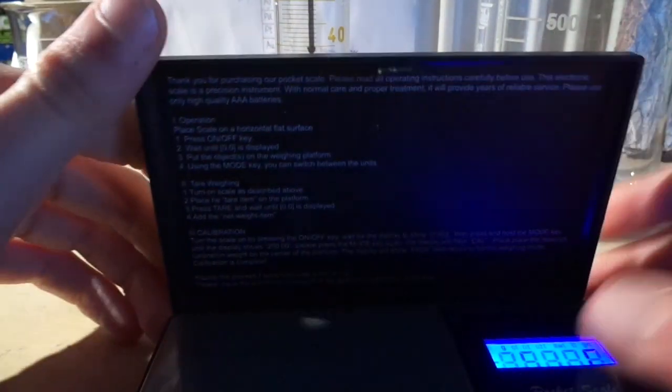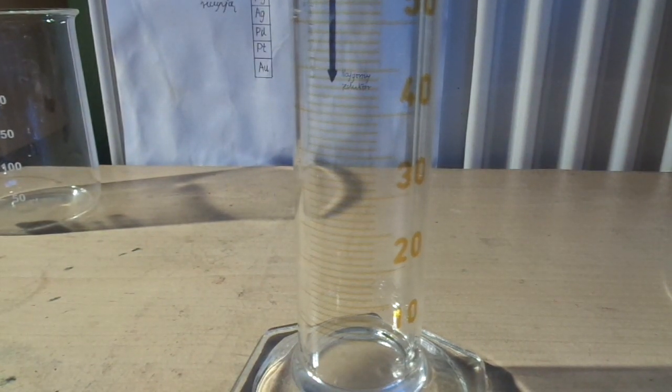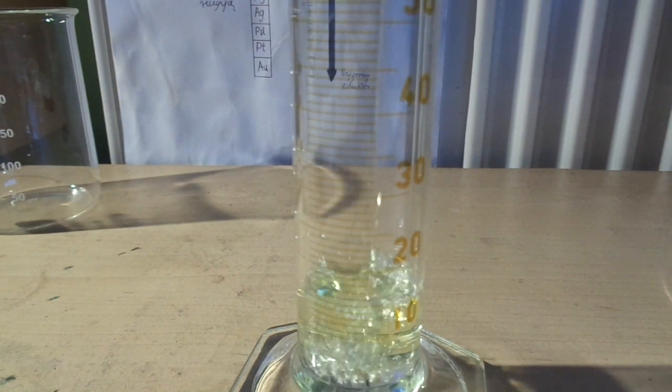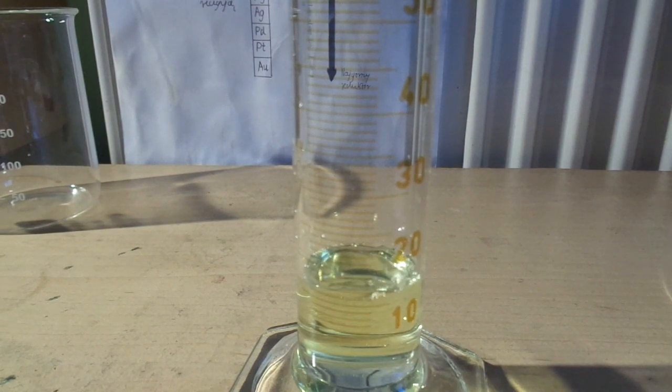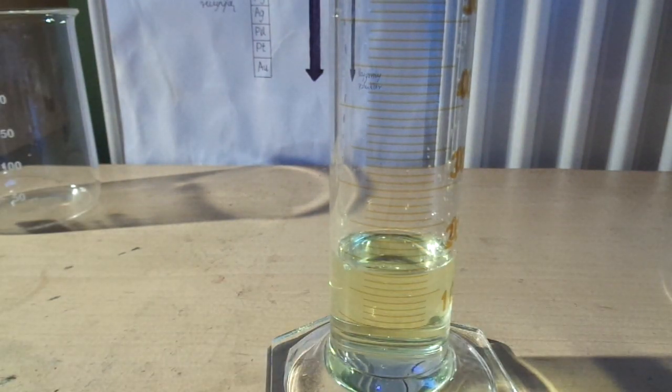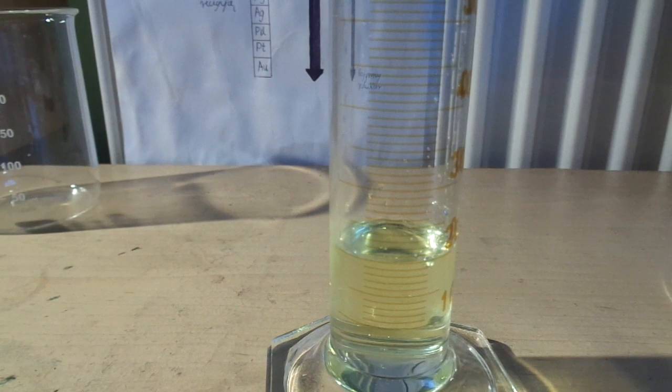Next thing, you will need hydrochloric acid, so I will measure that in the graduated cylinder. You will need 16 milliliters of concentrated 30% hydrochloric acid. I still need a little bit of an excess here. Especially because my hydrochloric acid is very impure. As you can see, it has a yellow color, which shouldn't happen.